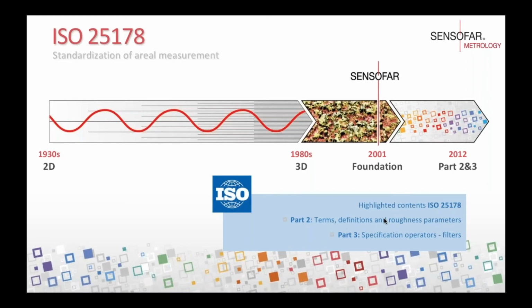This is a chronological axis which briefly explains how metrology has been evolving through time. At the beginning, metrology was using profiles in order to characterize surfaces, because in the 1930s the first stylus profiler was created. That technology was the one used for characterizing surfaces, but then in the 1980s, the first interferometer was created. And that gave metrology a new step, because we were able to characterize surfaces with 3D data.